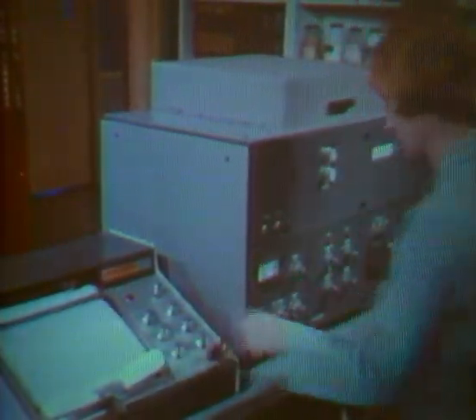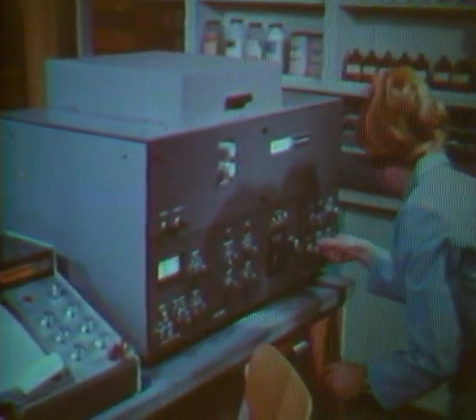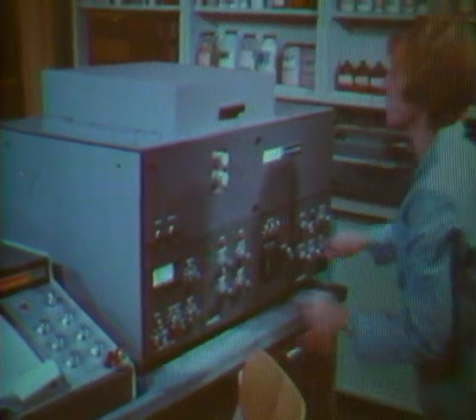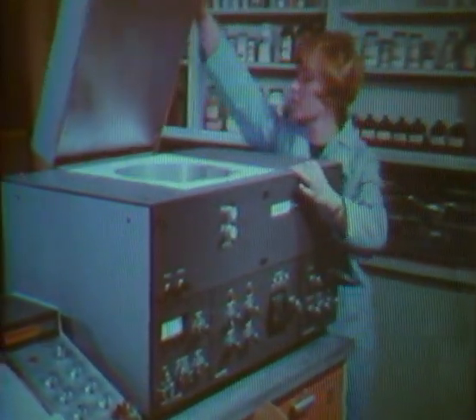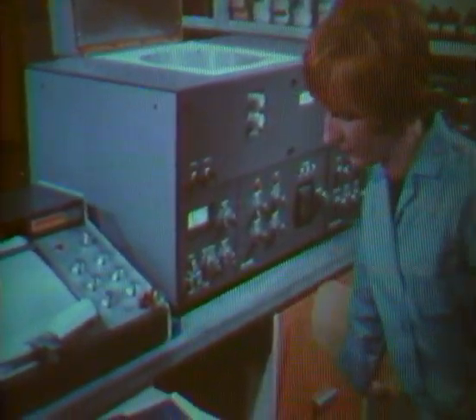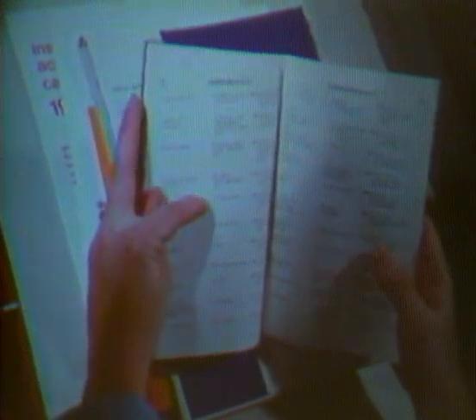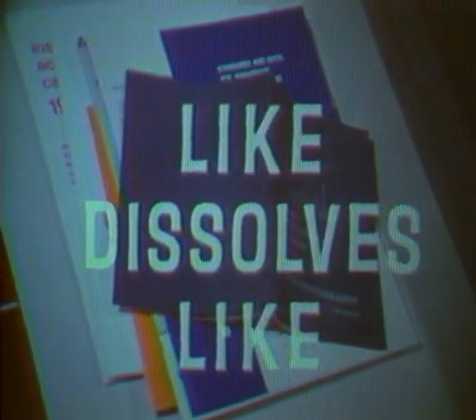Because choosing the proper stationary phase is so important in partition chromatography, let us investigate the factors that influence the selection. The choice of the stationary phase depends on the chemical nature of the sample and its boiling point. It is important that the stationary phases have very low vapor pressure at the working temperature. For most of the samples analyzed in practice, one can select among stationary phases with widely different chemical natures. The basic selection rule is, like dissolves like.